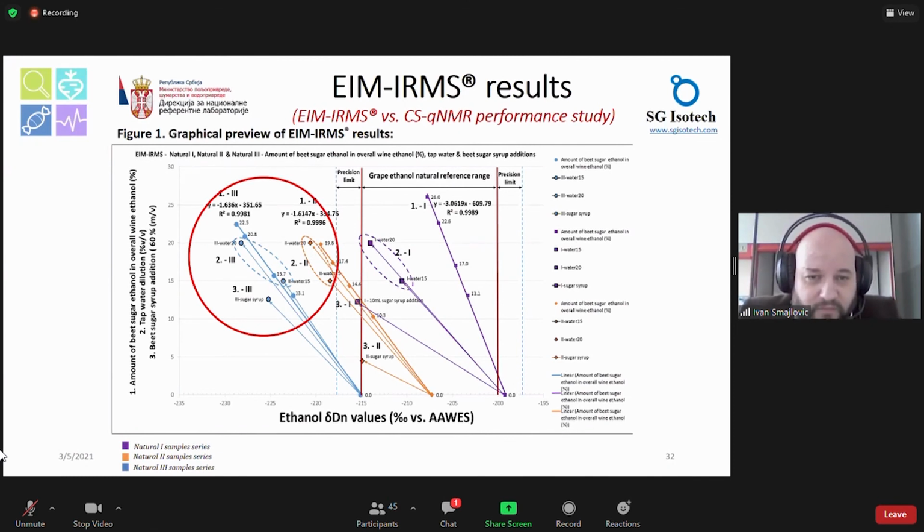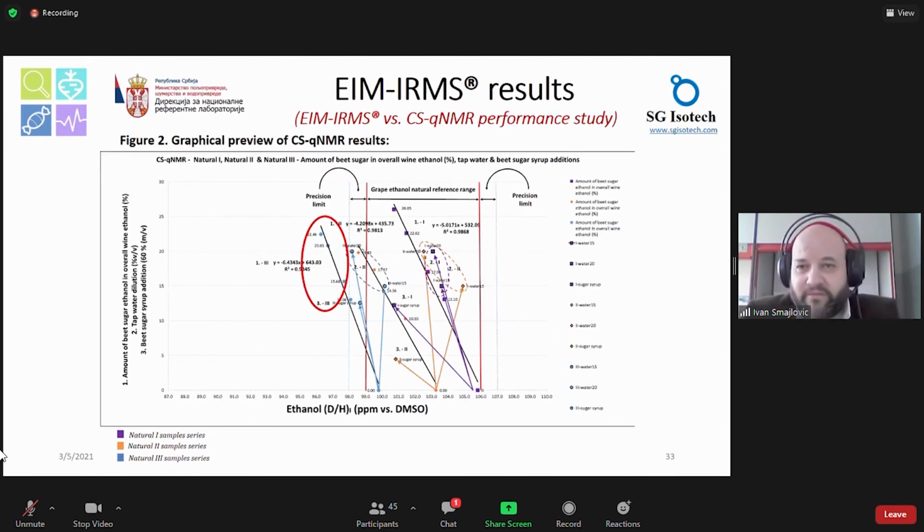I'm the only one in 30 years who found a way to get information like Gerard Martin with his SNF NMR. So we are hoping that this will give better possibilities for customs, for inspections, for national reference laboratories and all other laboratories to detect counterfeit products in the wine industry, strong spirit industry, fruit juices, and now we have honey. Yeah, we developed applications. We'll come to this. I don't know if I have more time.